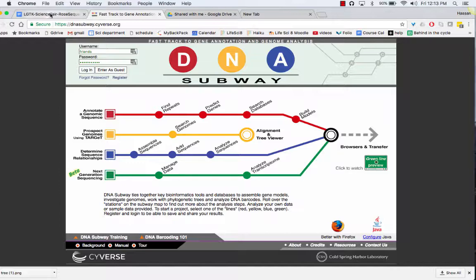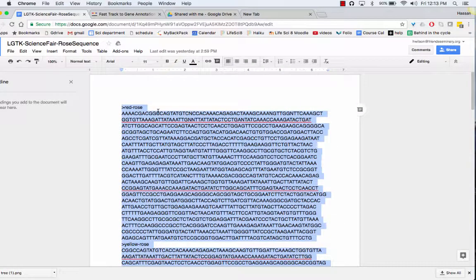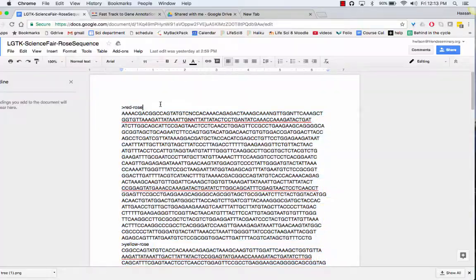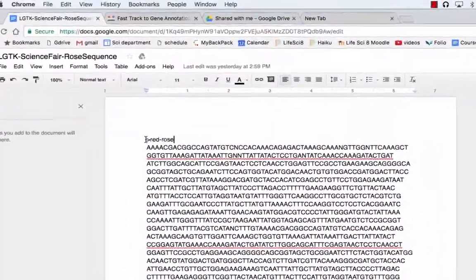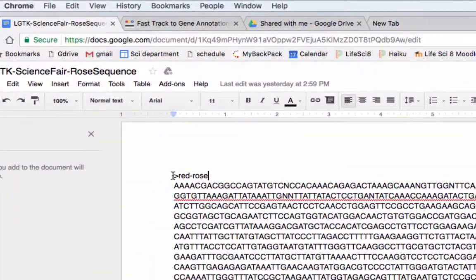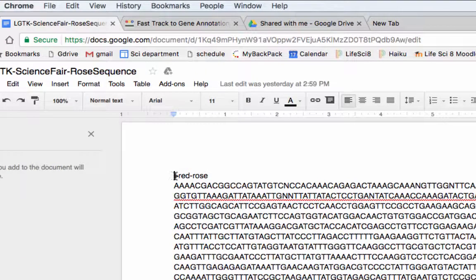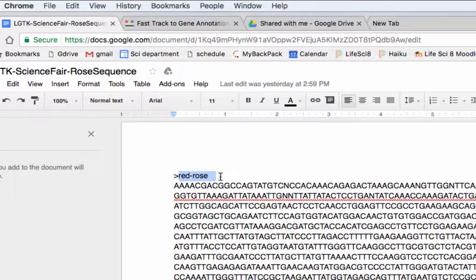So first you need your DNA sequences. I've already prepared these. You denote the beginning of the sequence with a greater than sign and then the name of your sequence. You have to give it a descriptive name.